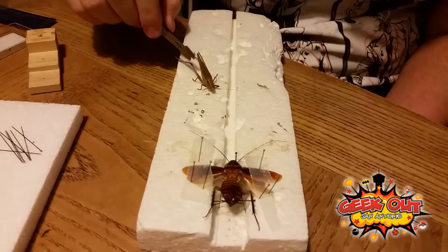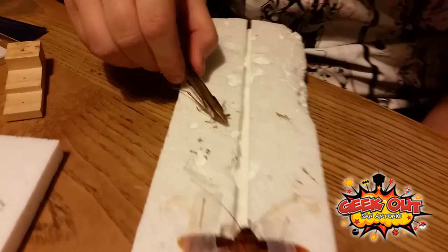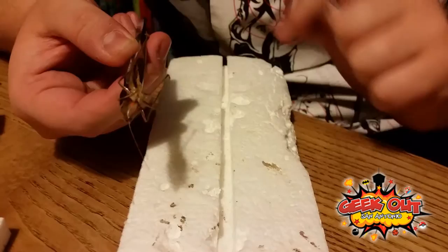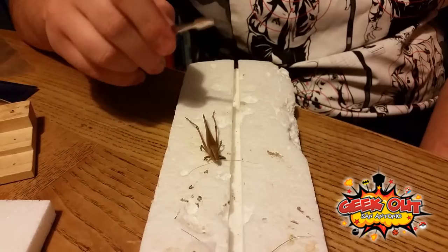Bug number two that we're going to spread today is a cone-nose katydid. It looks very much like a grasshopper, but you can tell by its face — it has its nose upturned right here and its eyes over here — that it's called the cone-nose katydid. It's got the legs and the reds around its cheeks, so yeah, it's a cone-nose katydid.